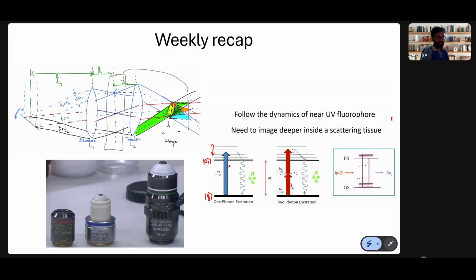This parallel beam is highly advantageous because it allows a researcher to insert subsequent optical elements such as a tube lens, dichroic mirrors and filters in the path.